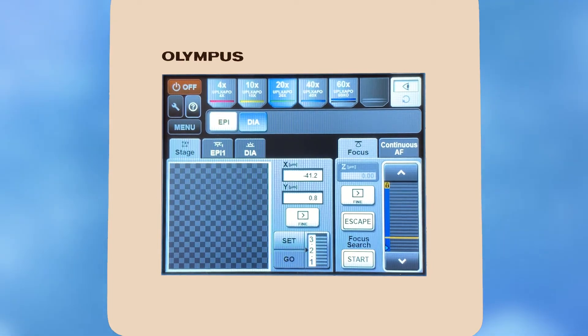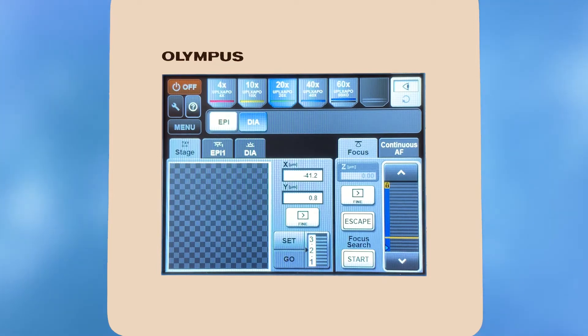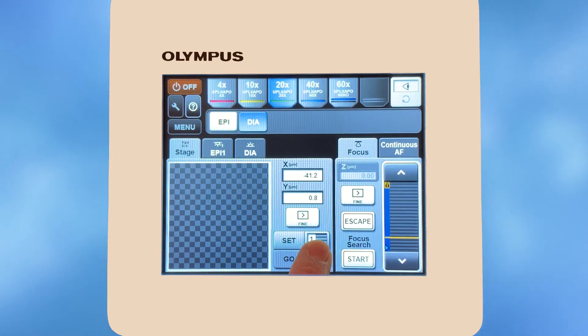To return to your original position, scroll back to the original position number and press go.